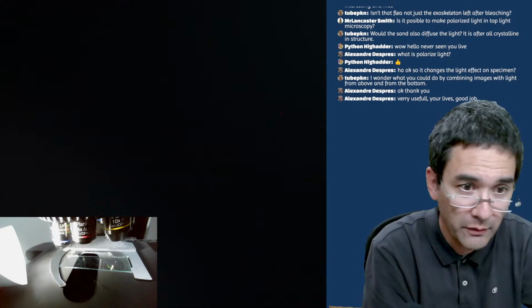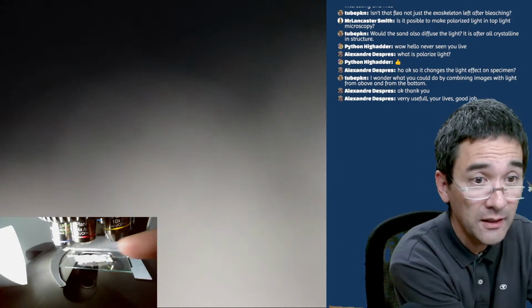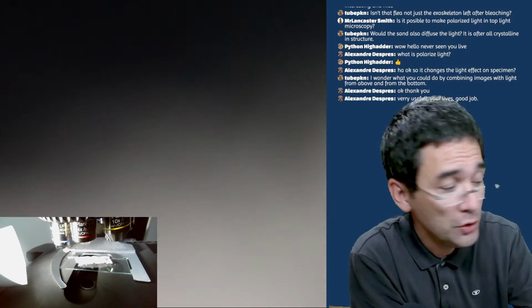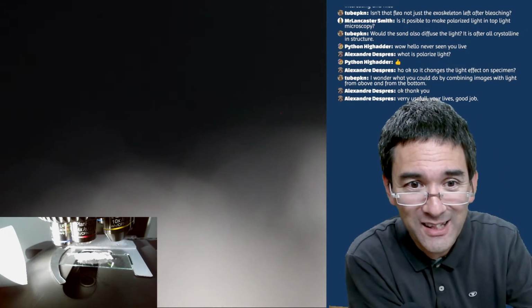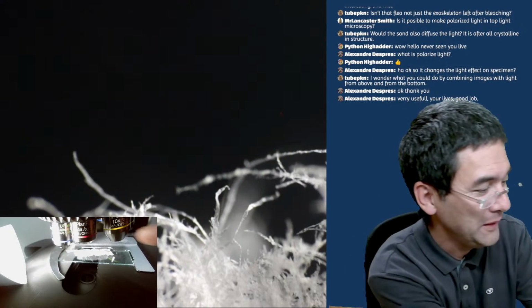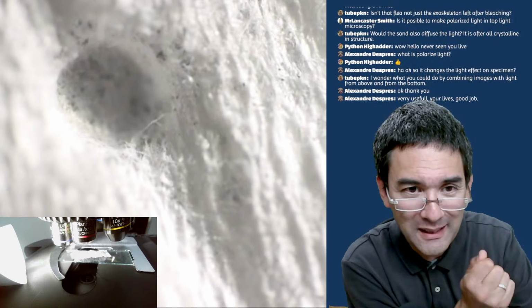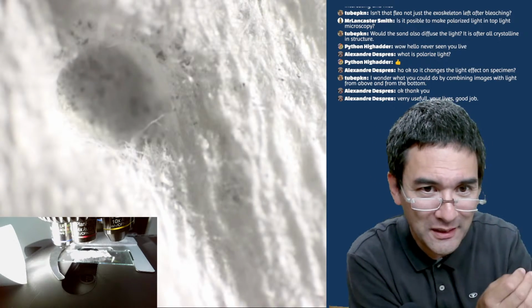Well, okay, over here a little bit of tissue paper. Just also going to put this in here. I think it's also kind of fascinating to look at tissue paper. It's really cool. I'm just going to tell you what you can try: you put tissue paper under the microscope and then you put some ink on it, and you can actually see the ink being soaked in.